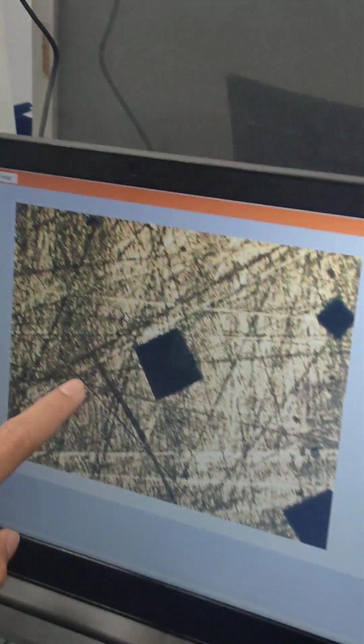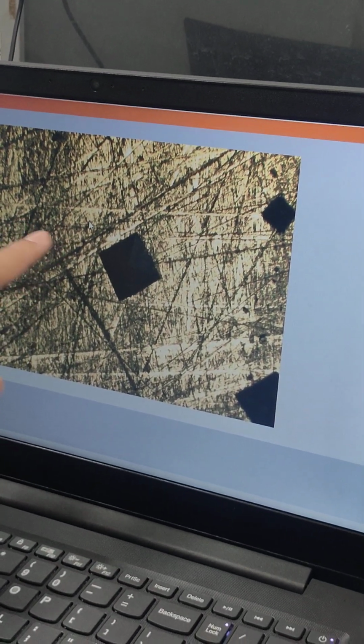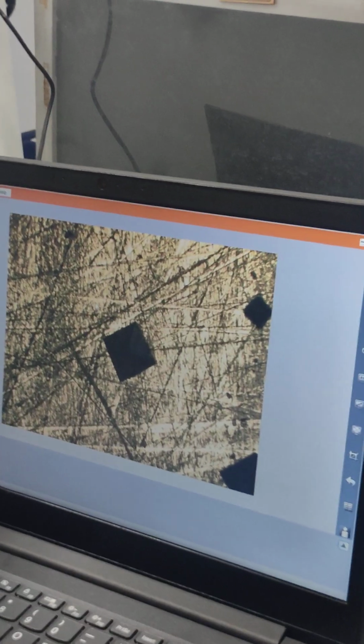Now you can see all of those scratches and ridges, and, how do you say it, the roughness, I guess, of the surface of the specimen. Yeah, scratches. You can see here we have the indentation. I think we could just open this up.